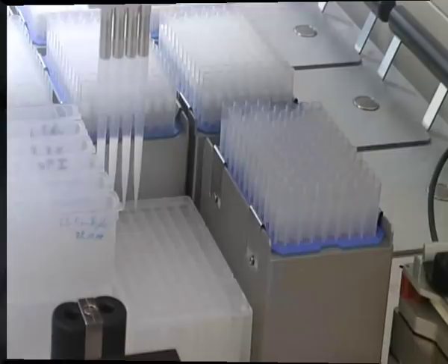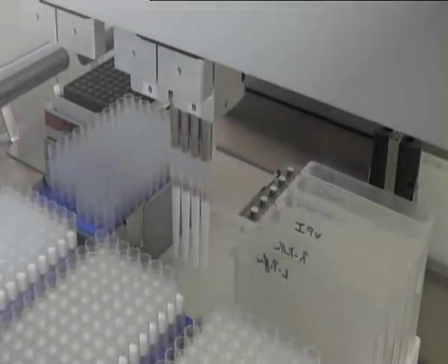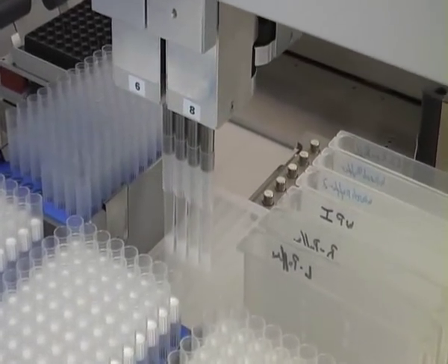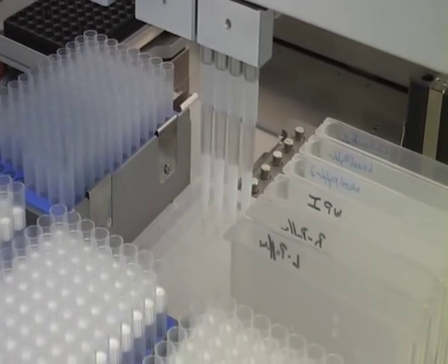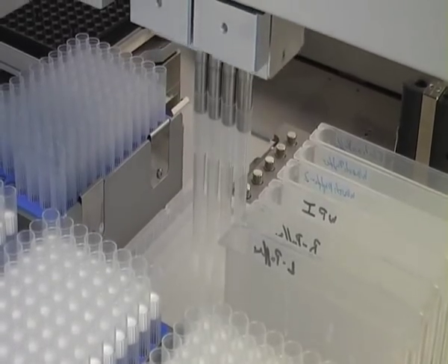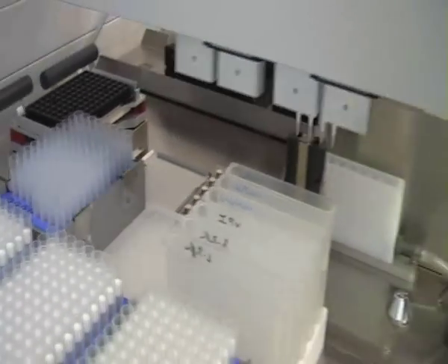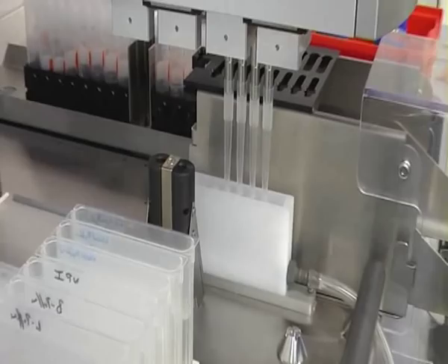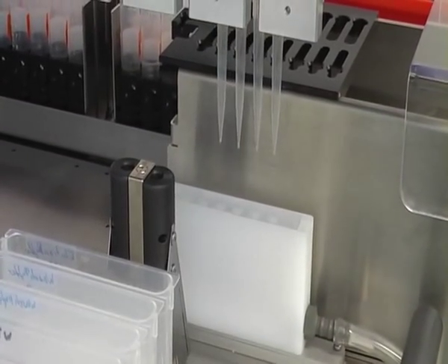Now the lysis buffer, which is contained in the Foodproof Magnetic Preparation Kit 1, is added to the wells containing the samples. Reagents that remain in the pipet tips are discarded in the liquid waste, and used tips are disposed of in the solid tip waste, which leads directly into a disposable waste bag.